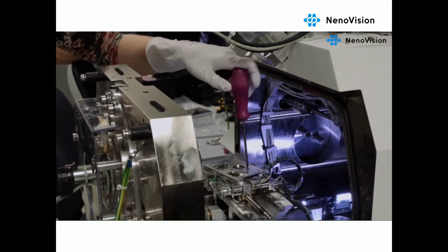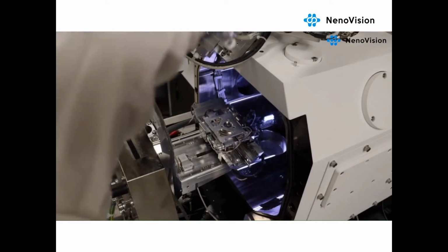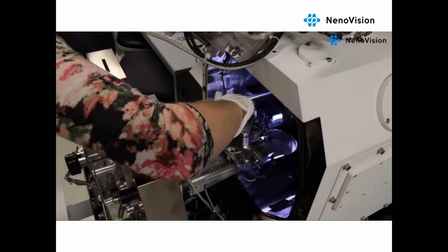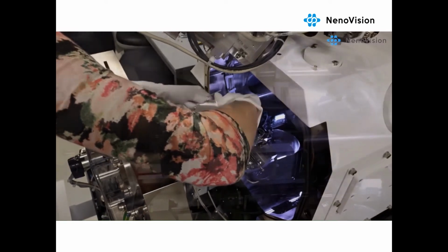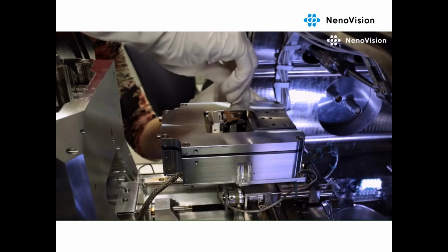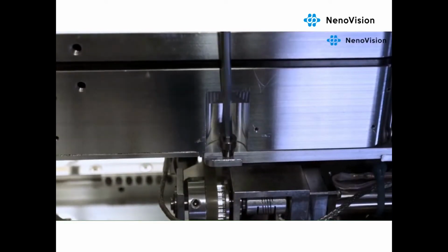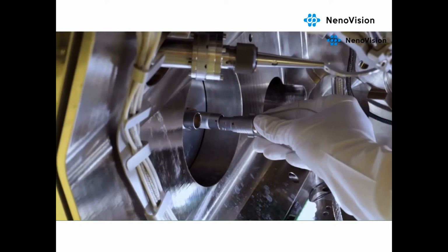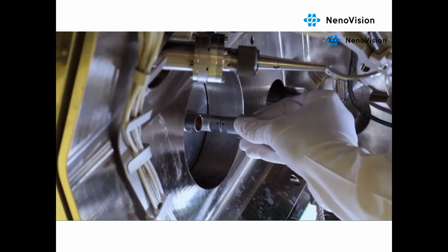We rotate the stage to the proper position, and then we fix the LiteScope with 3 screws to the adapter. Finally, we connect the LiteScope cables into the feed-throughs leading to NanoBox.